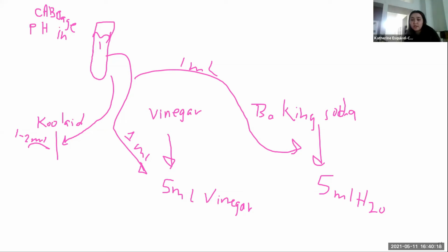Okay, so you add the 5 of the solution and then 5 of the water. Yep. Okay, because it says 50 milliliters. Yeah, but if you do 50 milliliters, it's going to be too dilute because you're just a little bit over. You're cutting out. Sorry.